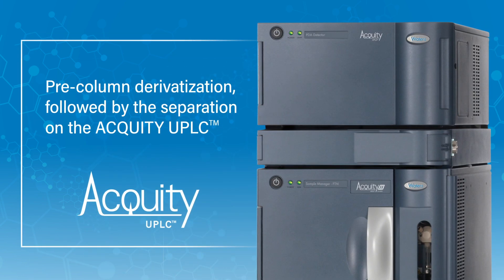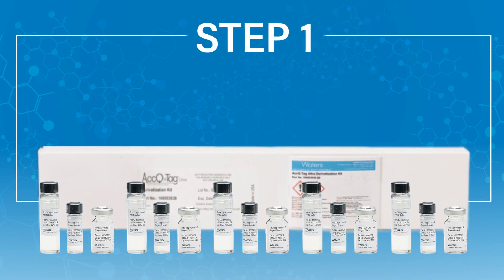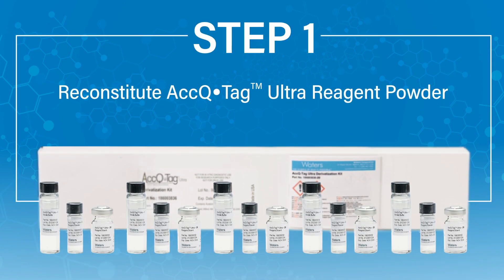The UPLC Amino Acid Analysis Application Solution is based on a pre-column derivatization of the amino acids, followed by separation on the Acquity UPLC. The first step in the sample preparation is to reconstitute the AccuTag Ultra Reagent Powder.